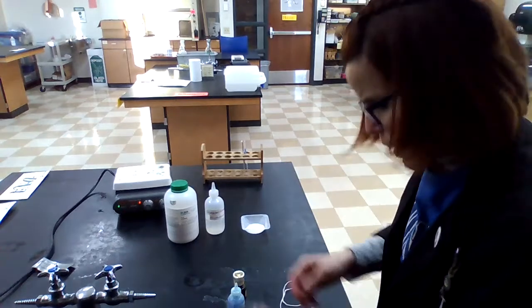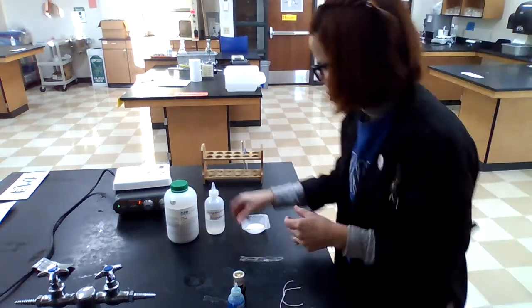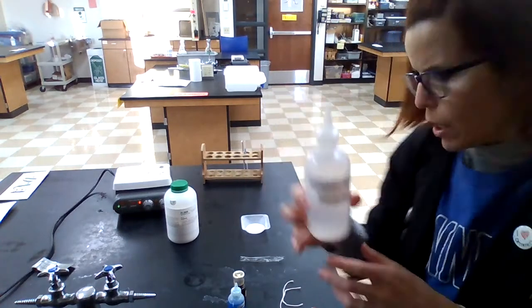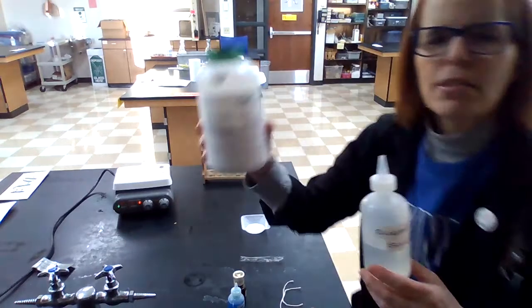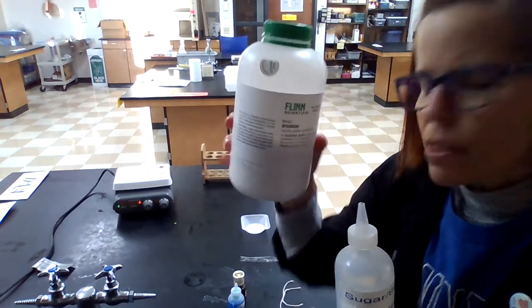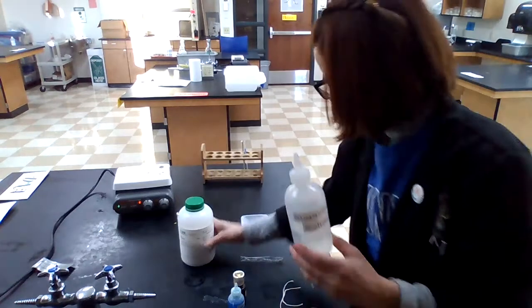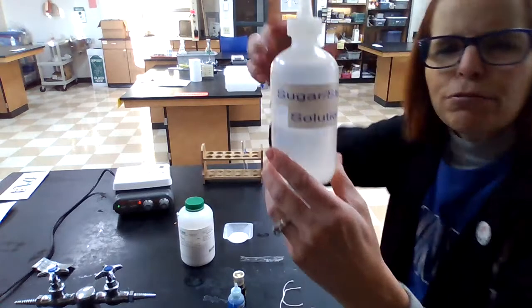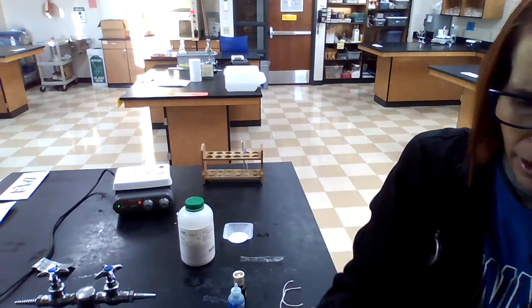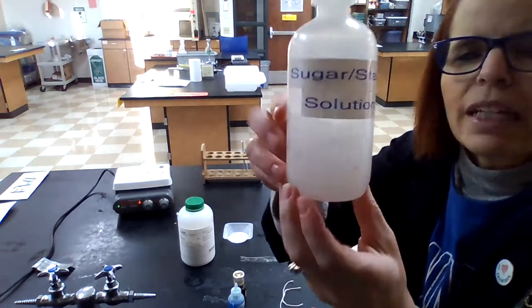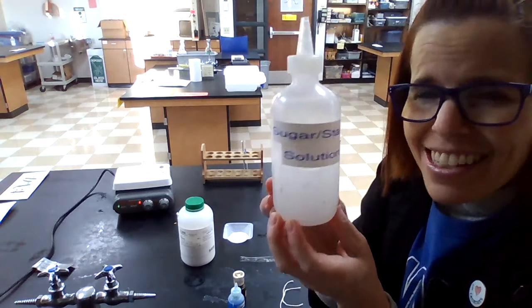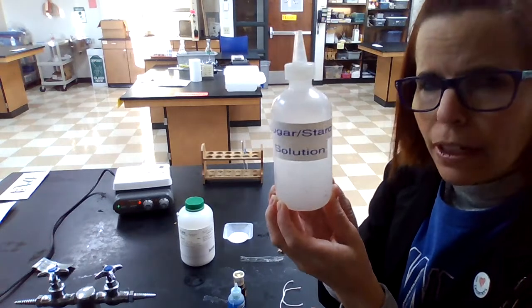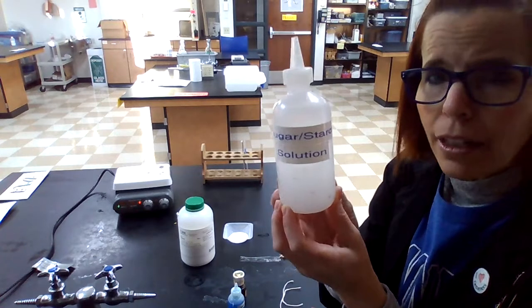I've got my semi-permeable membrane. In here I have a solution called the sugar-starch solution — just water with dissolved starch and dissolved sugar. They're floating in here. Our task today is to try to figure out which is bigger, sugar or starch.